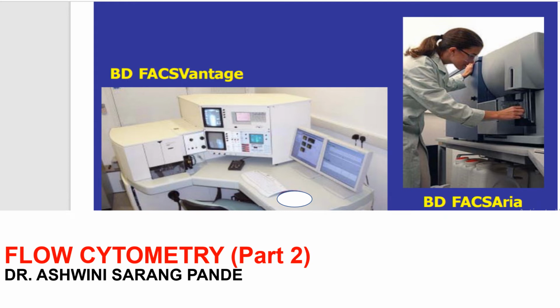Welcome back, students. In the first part of this video, I have already discussed the working principle and design of flow cytometry. Now, in the second part of this video, we will discuss data analysis and certain applications of flow cytometry.